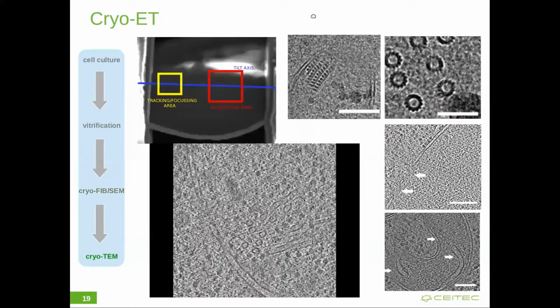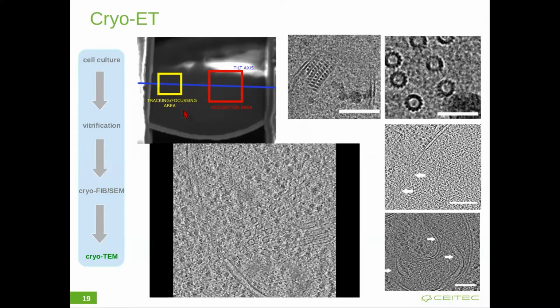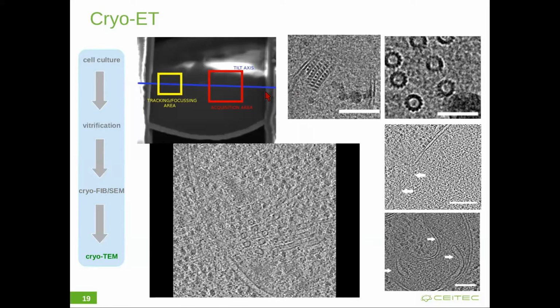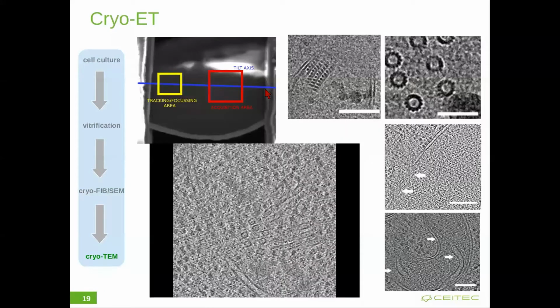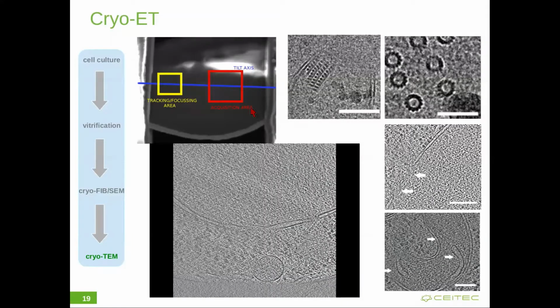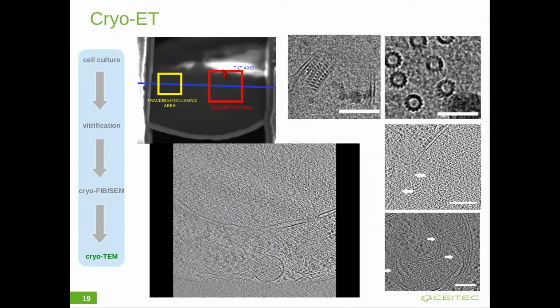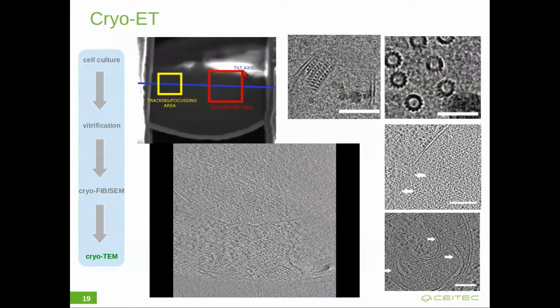So afterwards, we have the lamella ready. We transfer it to the transmission electron microscope. The important point here is that when transferred to the transmission electron microscope, the lamella is positioned in a way that its direction is perpendicular to the tilt axis of the microscope, and that would mean that we can select the area of interest and have the focusing and tracking area at the same height, and the area of interest is not obstructed by the lamella edges during the tilting experiment.